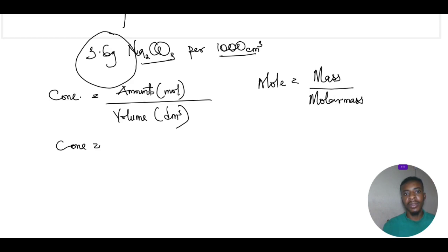Let's calculate the amount first so that we can just substitute into the formula.